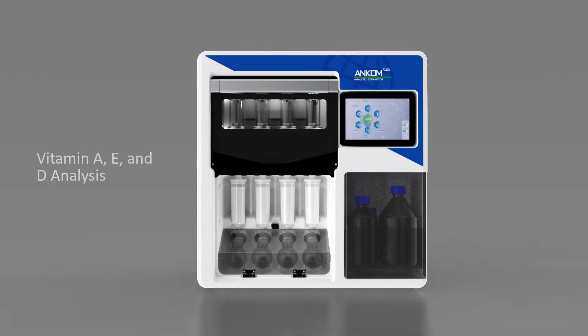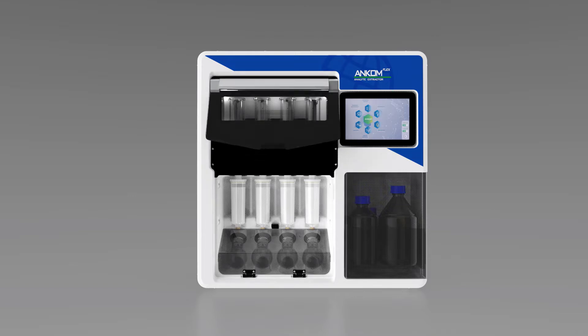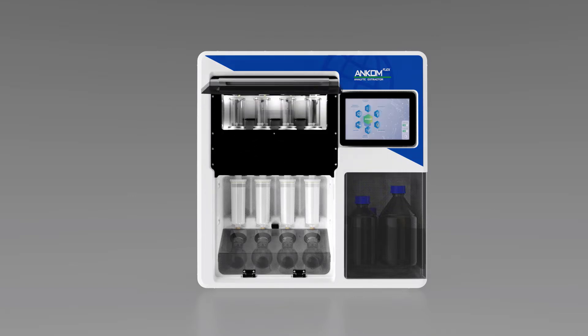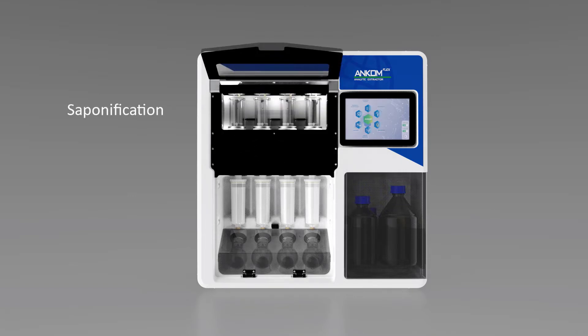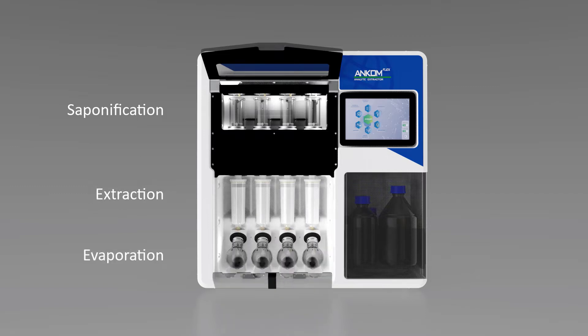This fully automated system allows the user to run any methods that require saponification, extraction, and evaporation in one integrated unit.